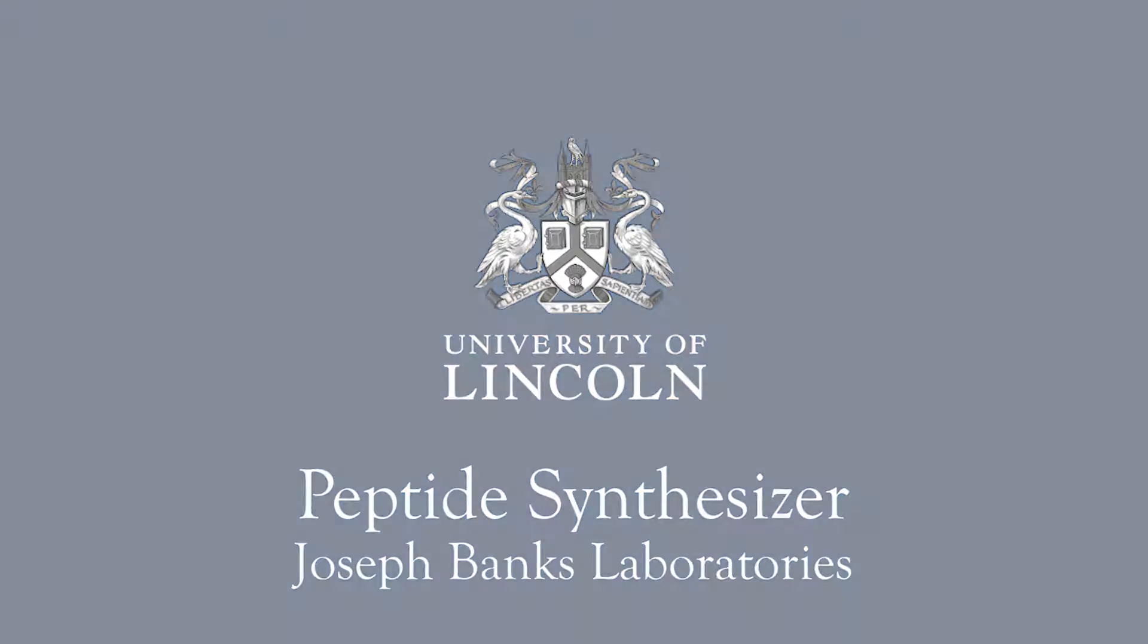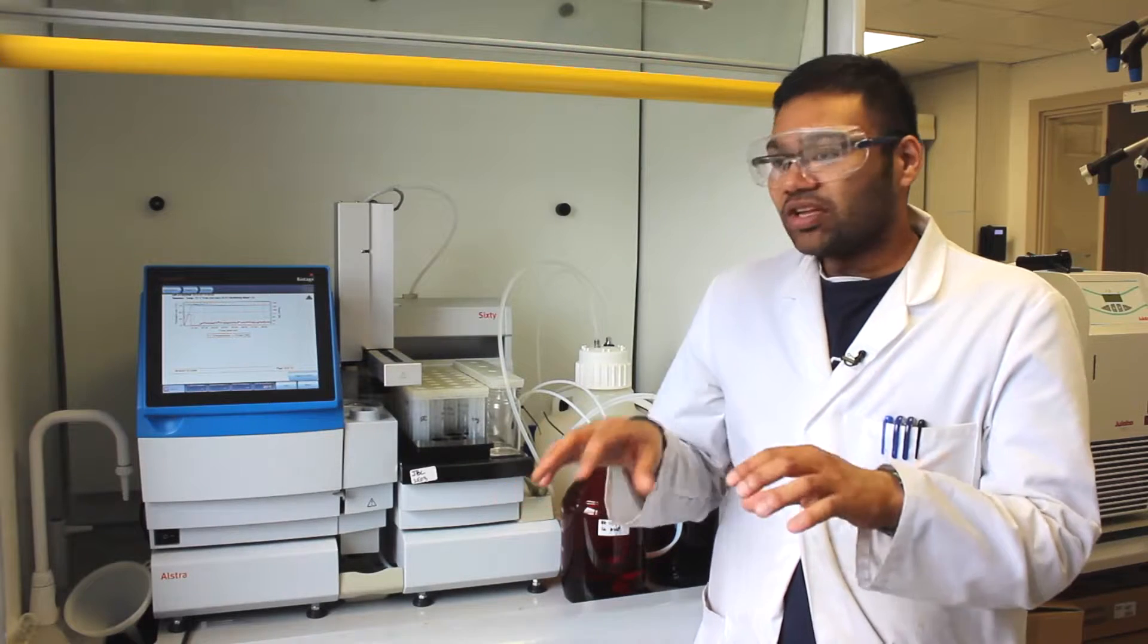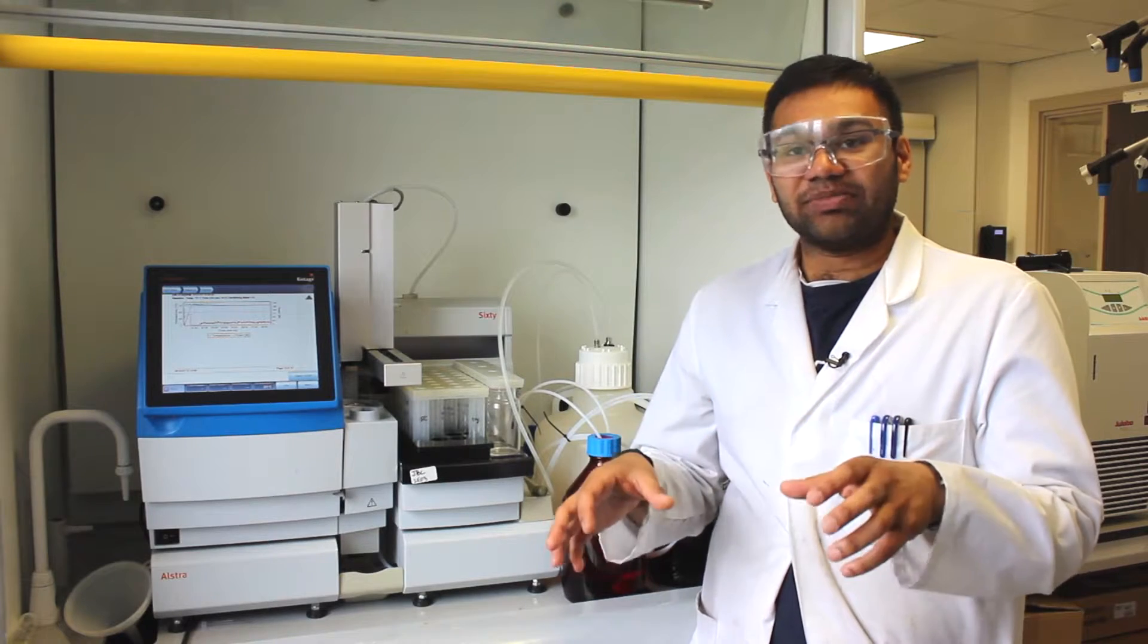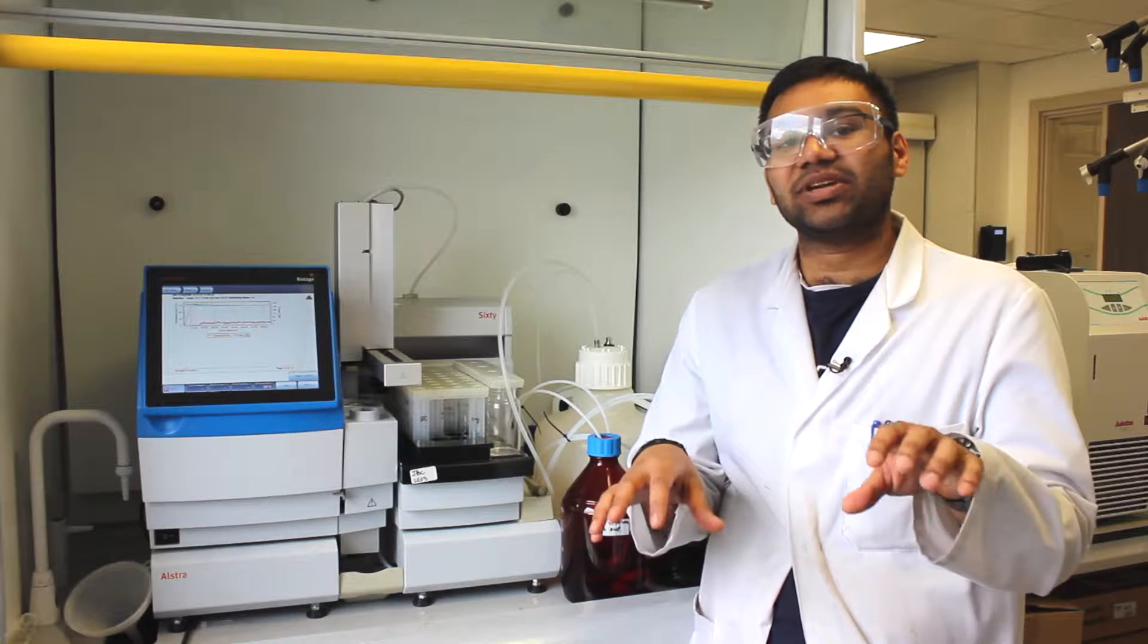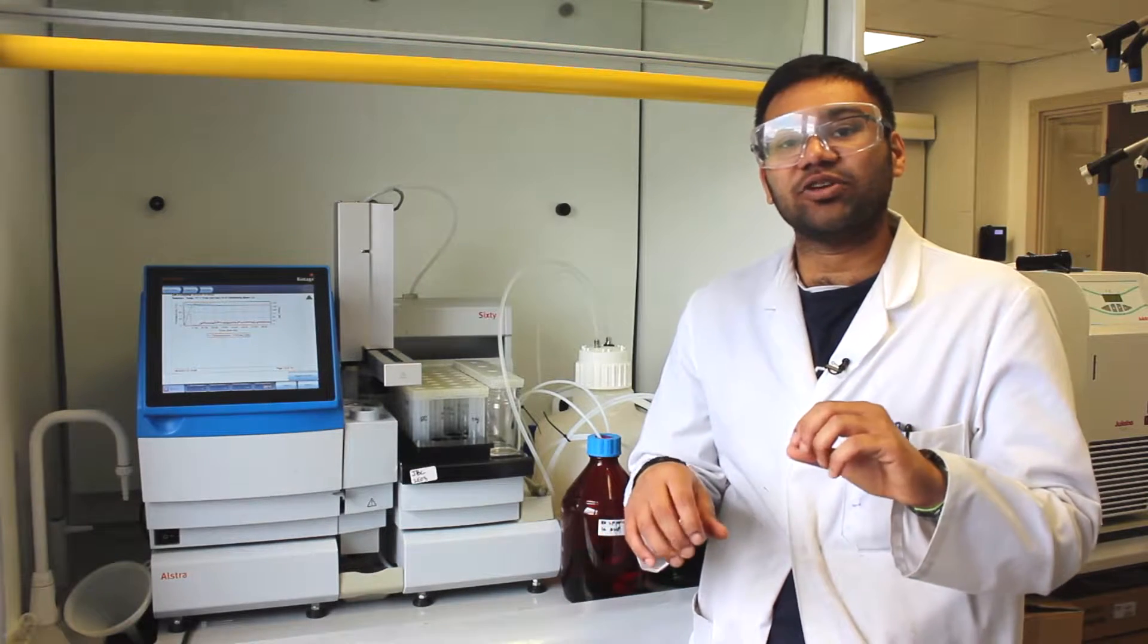This is an automated peptide synthesizer. So let me first explain what are peptides. Everybody is, I suppose, familiar with proteins, which are the basic building blocks of the human body.